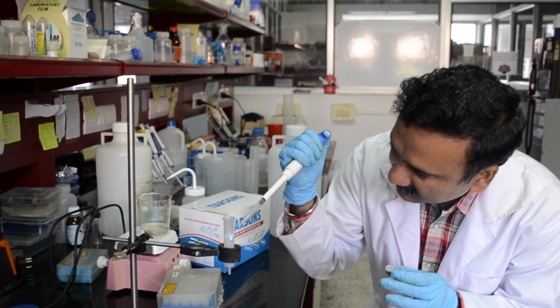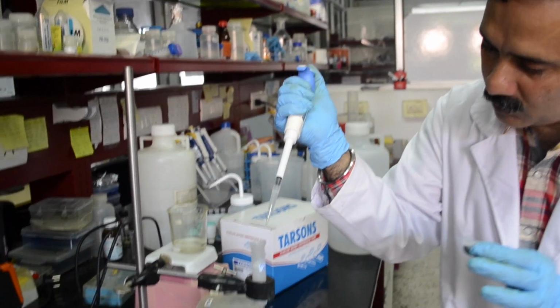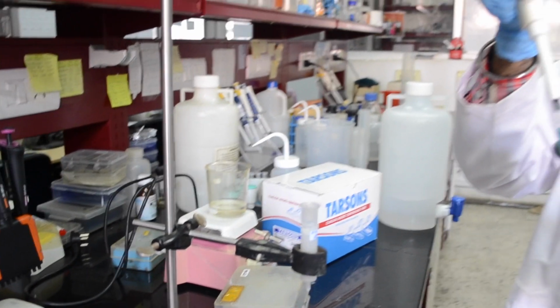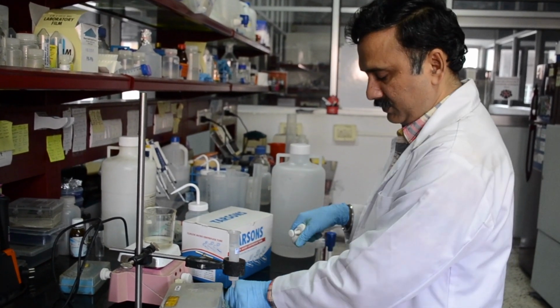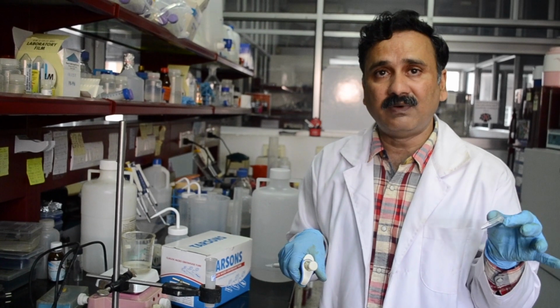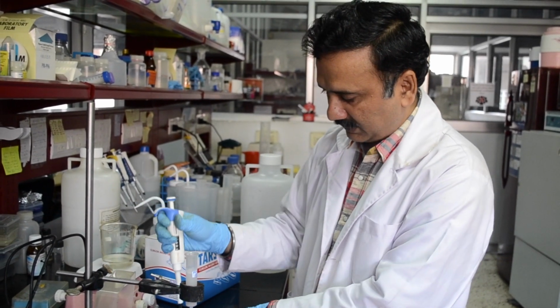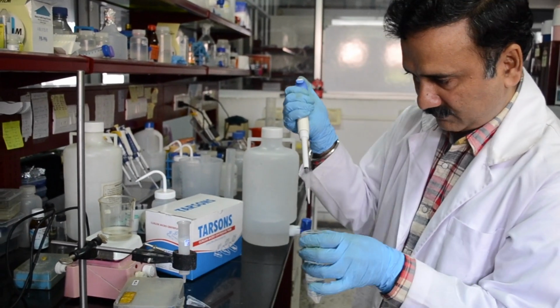So you can see the level has reached the disk, and now you can simply mix the solution first, and then load it onto the column. You have to wait for this protein solution to get into the column, and if you are interested, you can preserve some amount of sample so that you can verify your recovery. Once this goes down to the level of the column, we are going to add the buffer or the water.